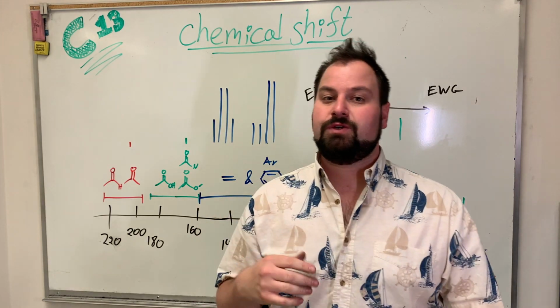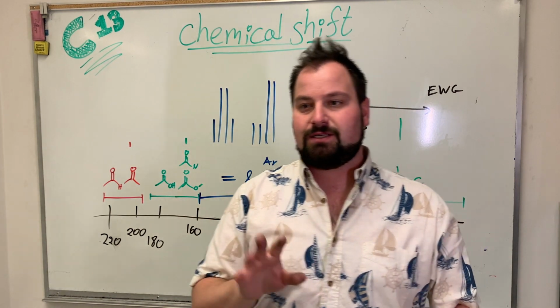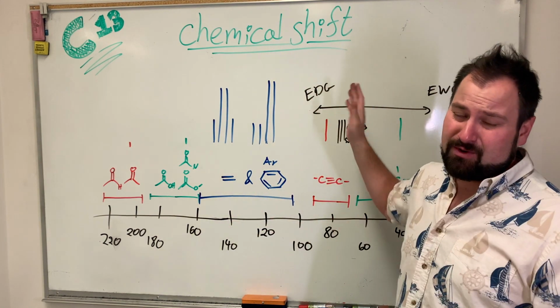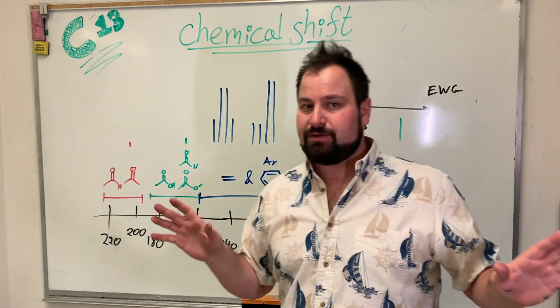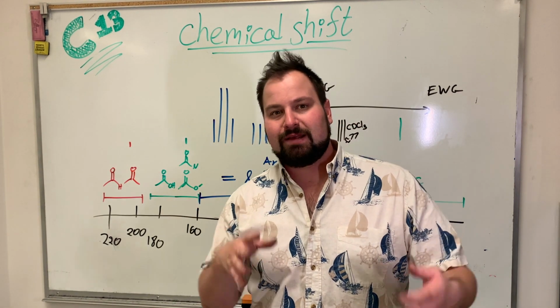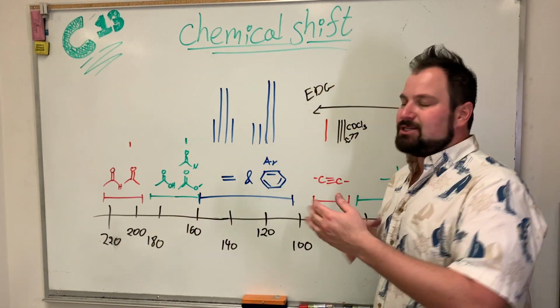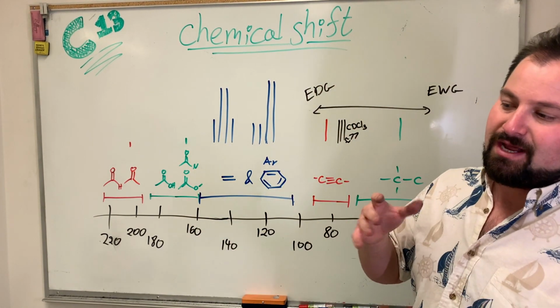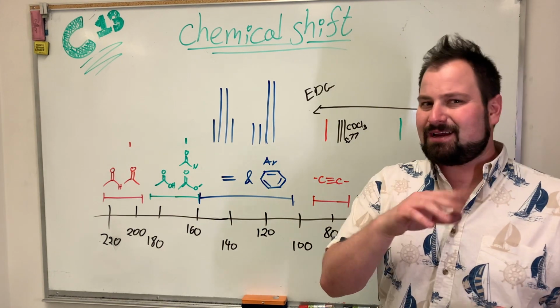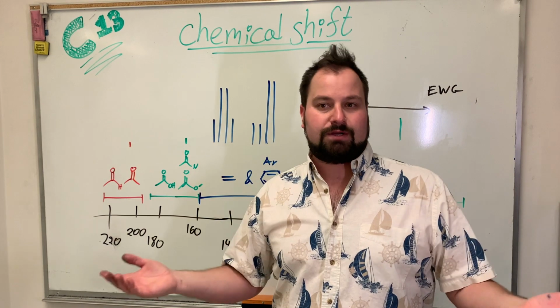Now switching over to carbon-13 NMR, we have a few things to discuss here. First is that it's basically all chemical shift. There is no multiplicity, there is no integration, but mostly. It's essentially all chemical shift. And you can, in general, figure out exactly how many carbons you have, just like technically you can figure out how many hydrogens by literally counting the total integration.